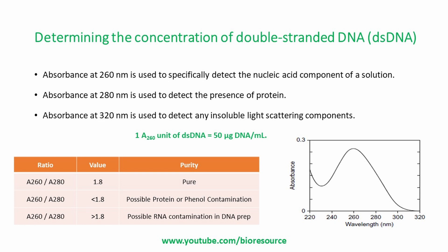When nucleic acid is purified from a biological source, calculating the ratio of readings obtained at 260 and 280 nanometers gives an estimate of how pure the nucleic acid preparation is. Pure DNA, free of any protein contamination, will have an A260/A280 ratio of 1.8. If the preparation is contaminated with phenol or protein, the A260/A280 ratio will be less than 1.8. If RNA contamination is present in the DNA prep, the A260/A280 ratio may be greater than 1.8.